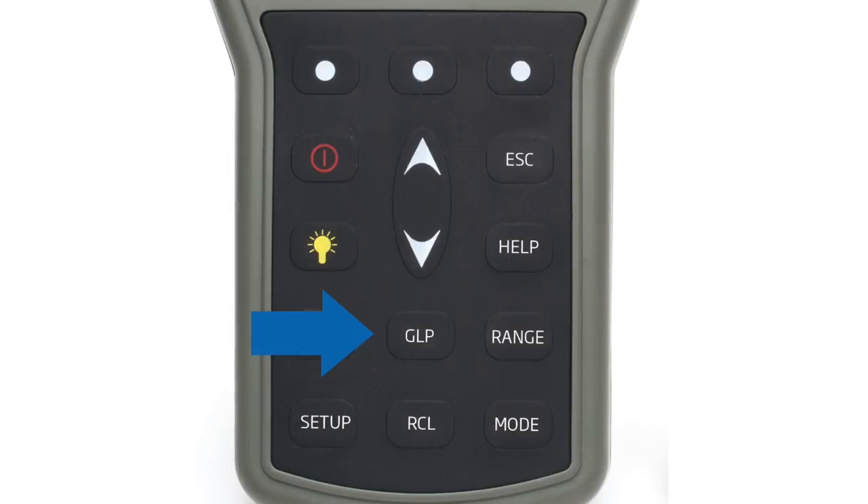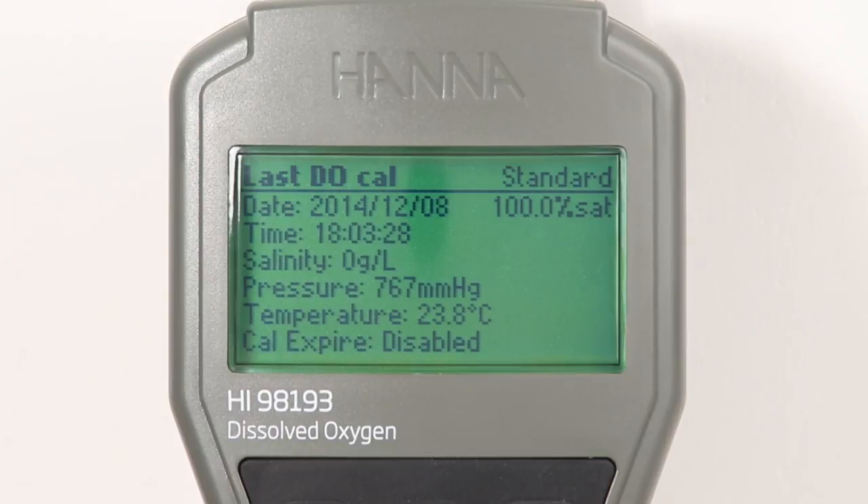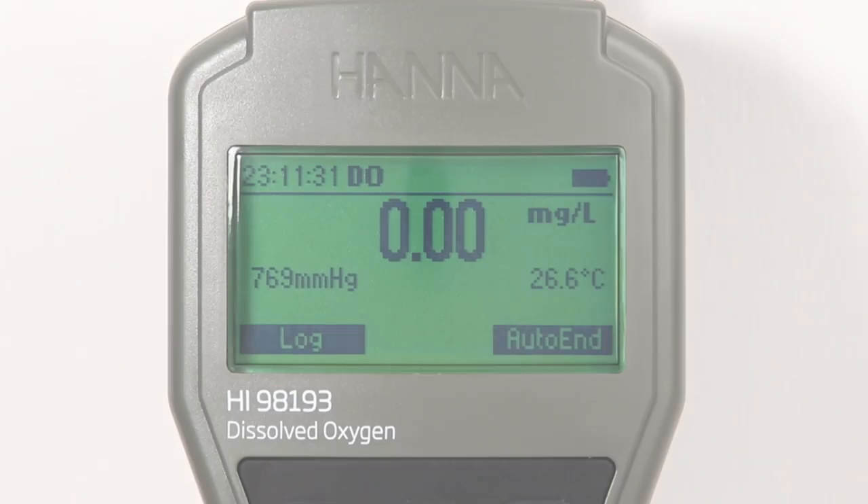Calibration data is stored upon exiting and can be reviewed by pressing the GLP button. The GLP data includes the last calibration date, the standards that were used, salinity, pressure, temperature, time, and days to expiration if enabled.